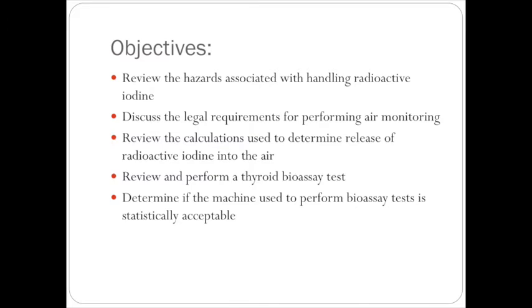And then last, we'll talk about one of the few places where statistics actually plays a role in the documentation of a test, and that is for thyroid bioassay especially. We're going to do some tests that are statistical in nature to try to determine if the data that you are collecting is as accurate as it possibly can be.